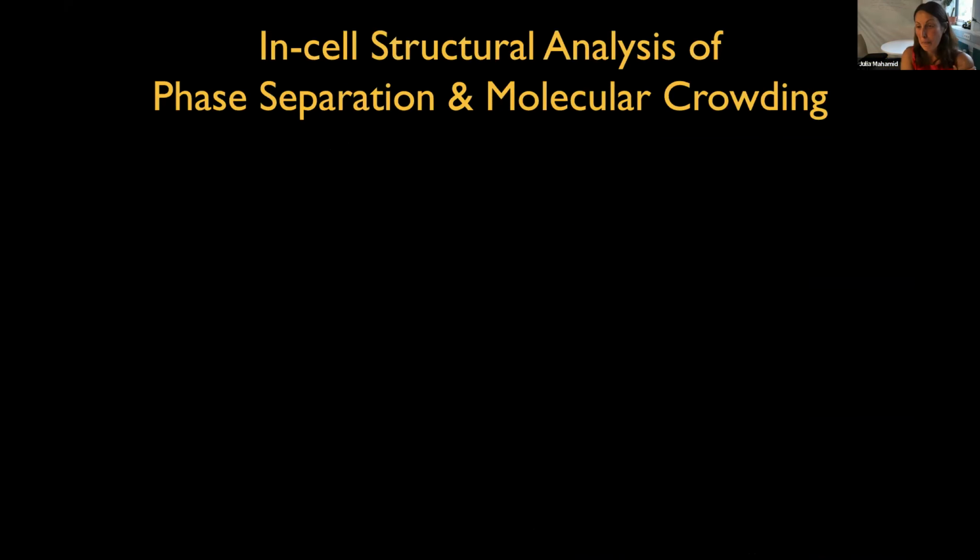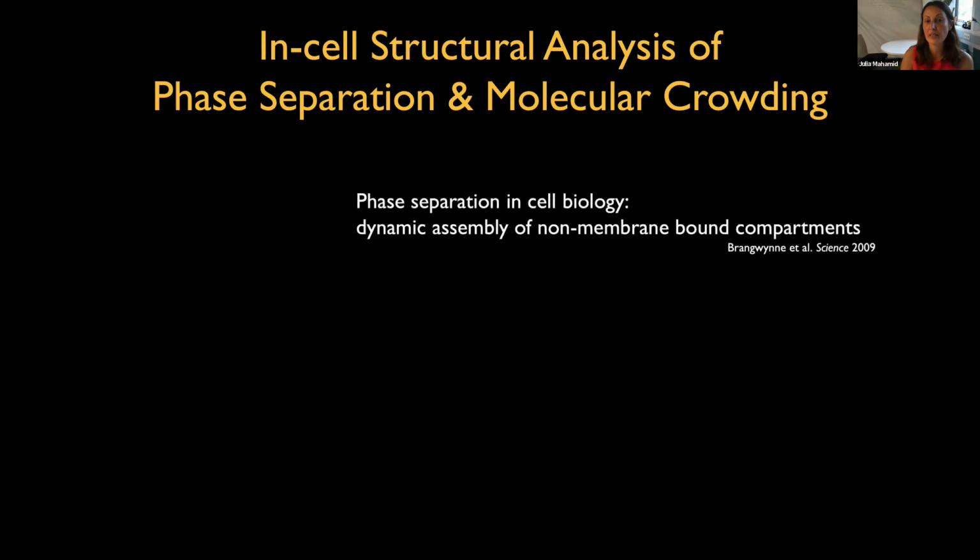And so basically, a major focus in my group goes beyond individual macromolecular complexes, and we basically try to understand or provide an in-cell structural understanding of biomolecular condensates as a simple mechanism that is used in cell biology where cells are able to form distinct biochemical compartments without the need to physically segregate them by membranes or lipid bilayers from the environment.